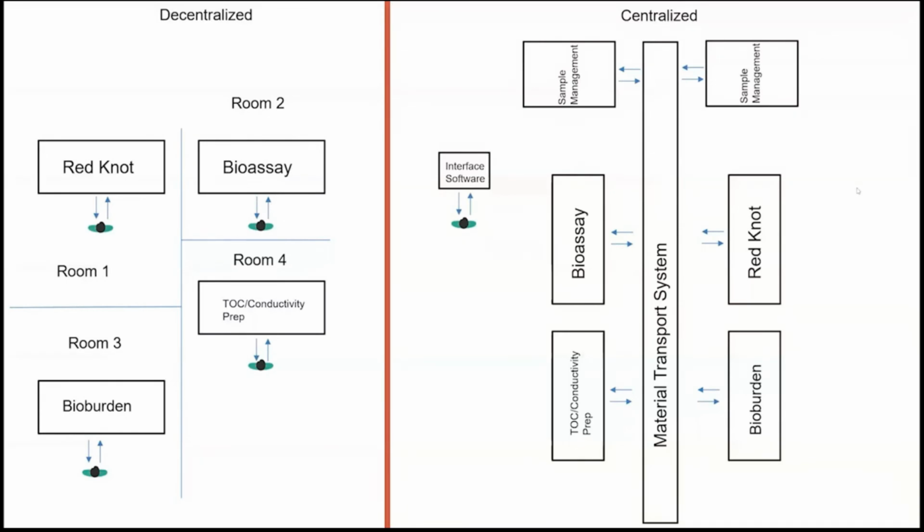However, developing standard platforms that we can deploy globally is easier in theory than in execution. Each manufacturing site has its own unique differences. For a particular assay, one site may be high throughput while the other is lower throughput, or one site may have more space dedicated for that particular activity than the other. For those reasons, we've decided to pursue a centralized or decentralized approach depending on the needs of the site.